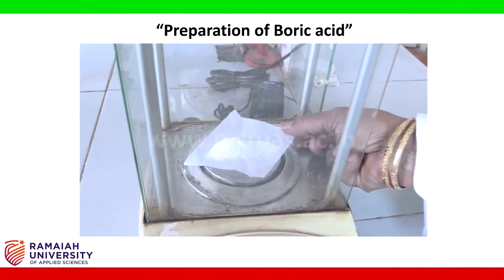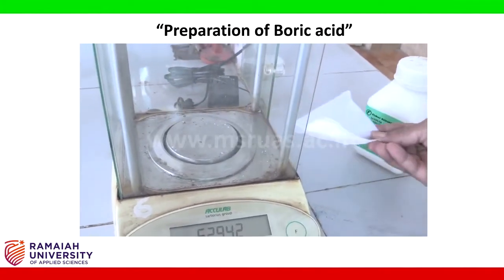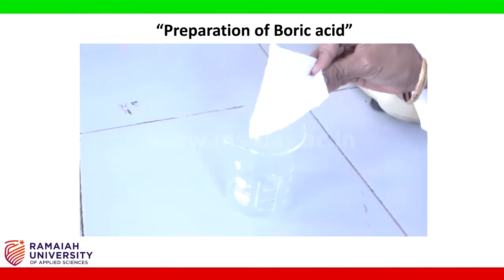Now transfer the weighed borax into a beaker.